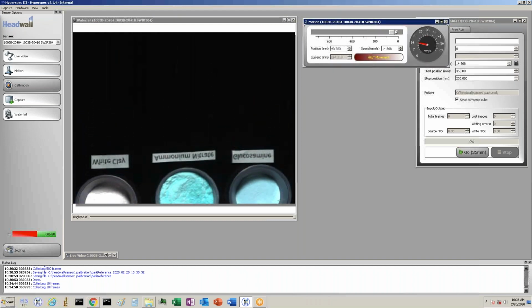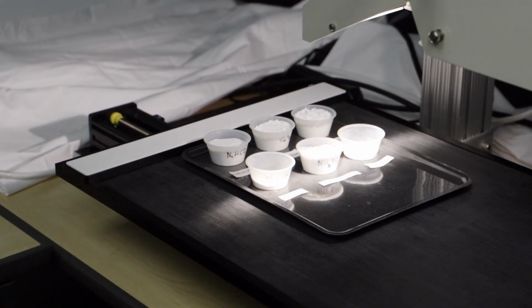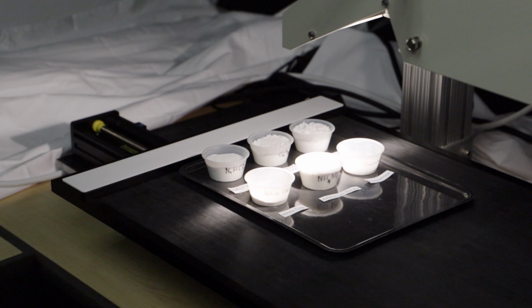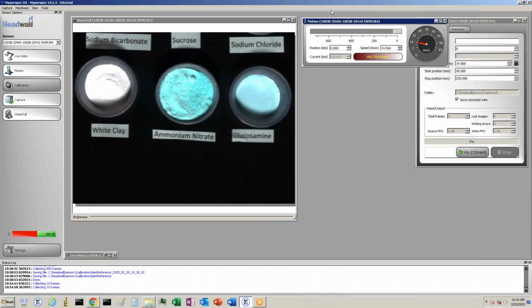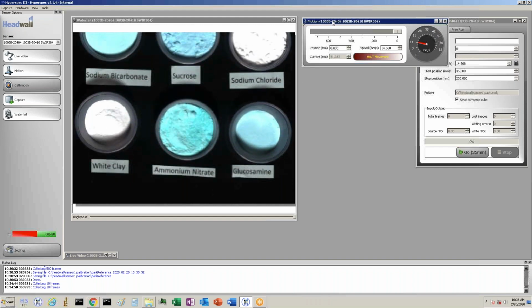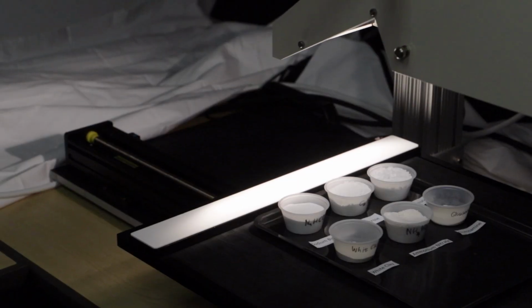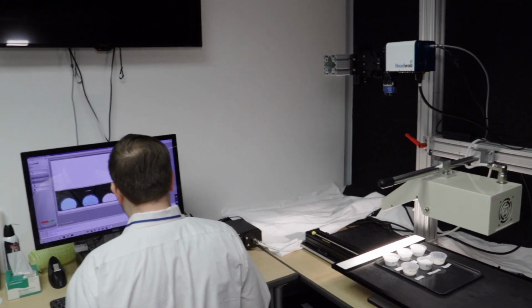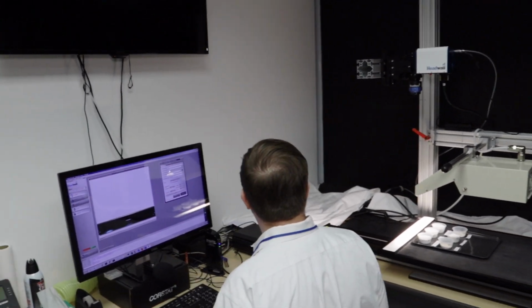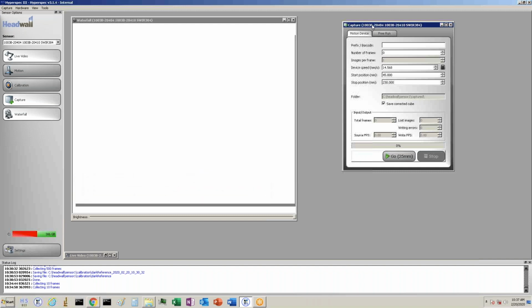And so we'll just go back to the 0 position, again moving the slider bar back to 0, and observing our samples showing up on the waterfall view. And now I'm going to name my sample. So this sample set is a series of white powders that we are going to differentiate by using our shortwave infrared sensor. So I'm going to call this sample set white powders.